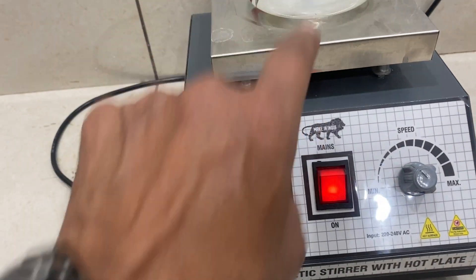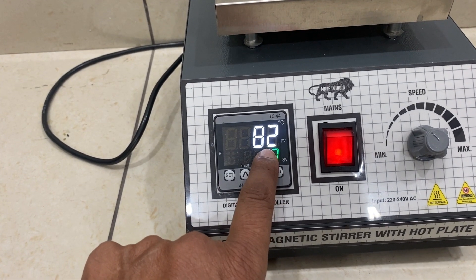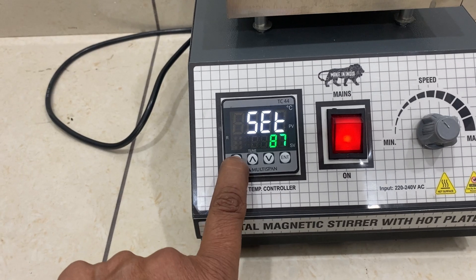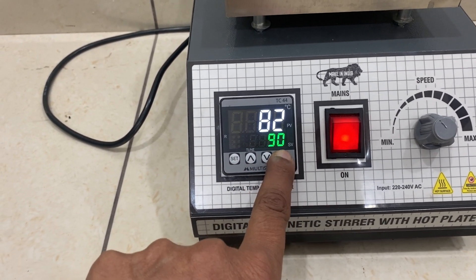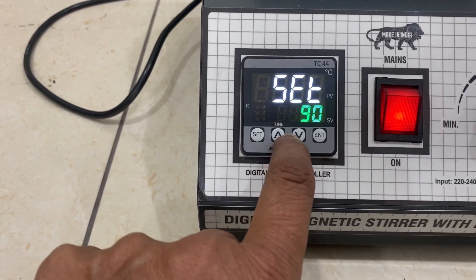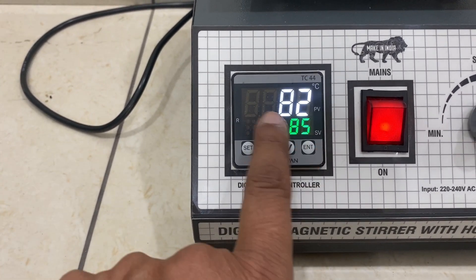The higher you go, there will be more difference because of evaporation and cooling from outside. I can set the temperature — increase it to 90 and press Enter, or make it 85 and press Enter, and it becomes 85.